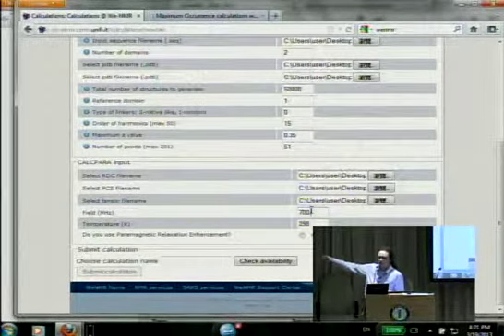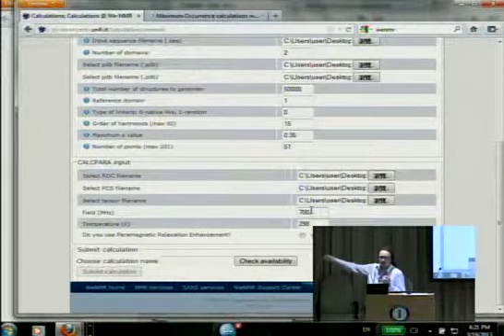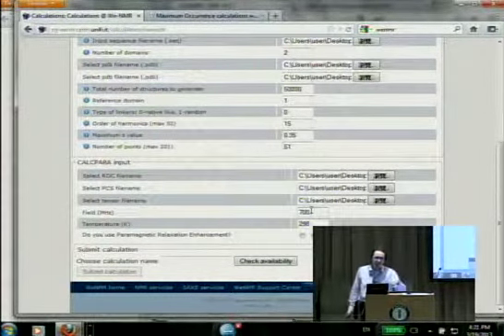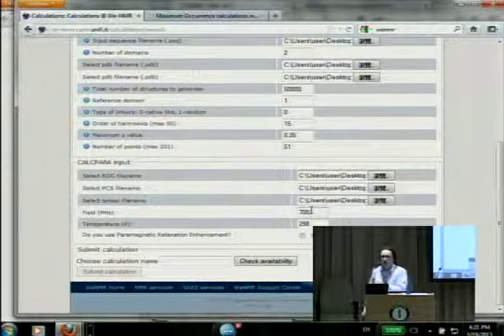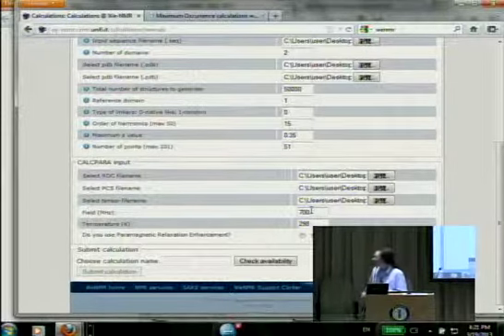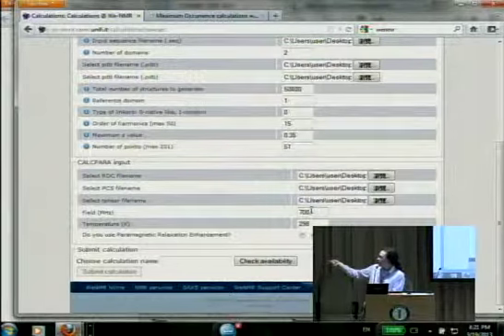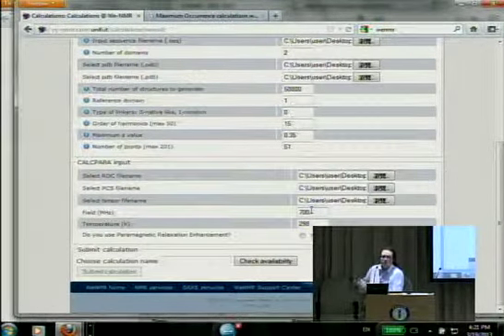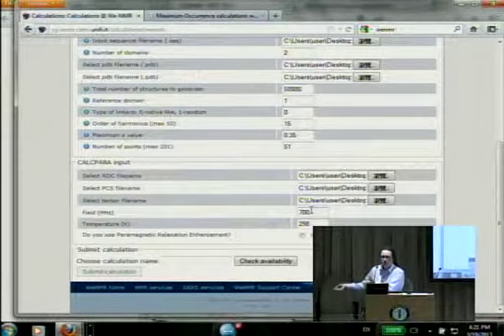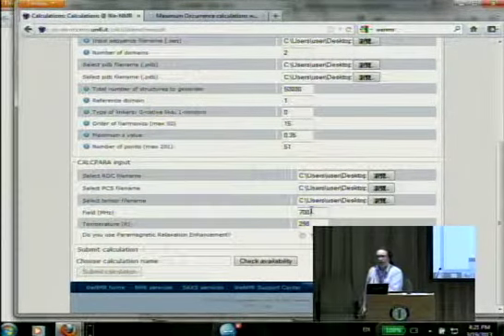You can also add other paramagnetic effects such as paramagnetic relaxation enhancements. As I mentioned, paramagnetism increases relaxation rates, and you can actually quantify that. There are specific measurements, very popular ones that you do with spin labels, but you can do essentially the very same measurement using the paramagnetic effect from metal ions. And then you just give it a name as usual.